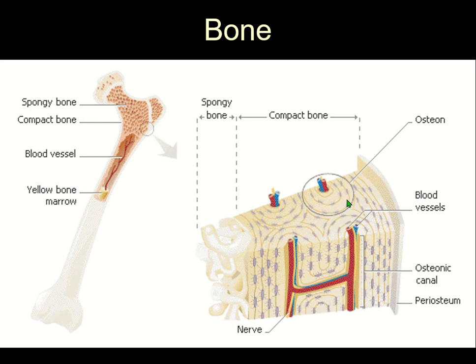So when you want to thin section bone, or a white material, it might be to identify that it's in fact bone. And you can see these osteons in the bone. And that's very different from, say, ivory, where it's all concentric, tooth-like construction of the material.